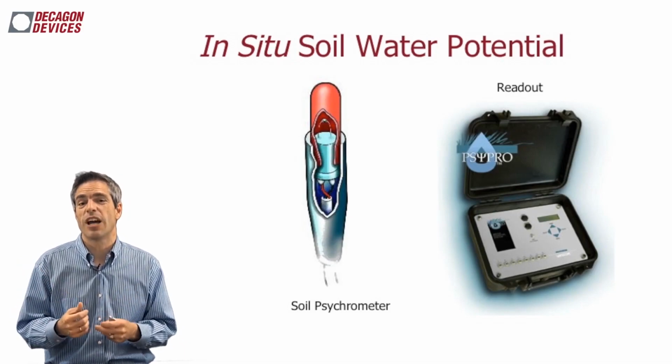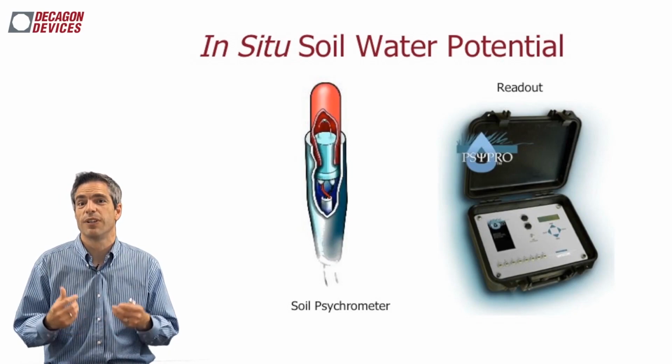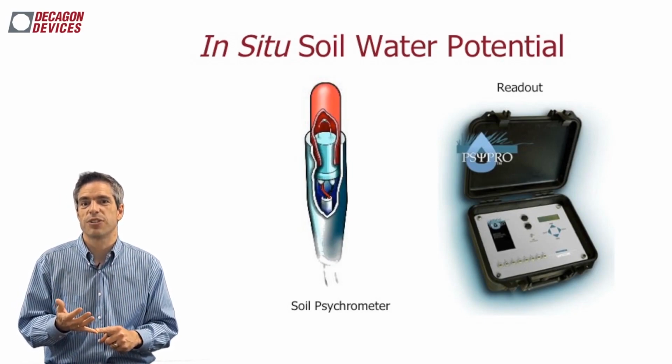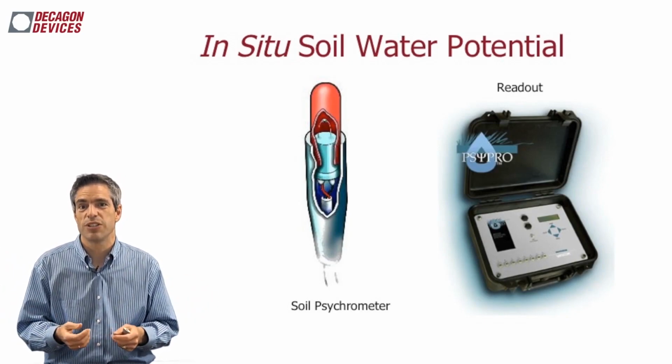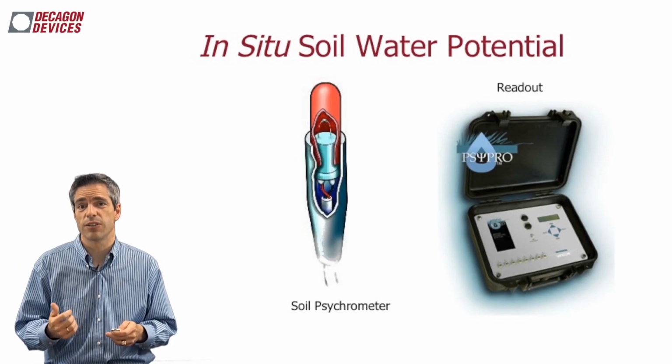Well, one of the challenges here with making this measurement, and I've done it many times myself, is simply temperature gradients. If we're trying to measure temperature to 1/1000th of a degree, sticking one of these things in a natural environment where the temperature is changing a lot plays havoc with the measurements. And you're going to have to take some time to be able to get really good measurements out of this system.